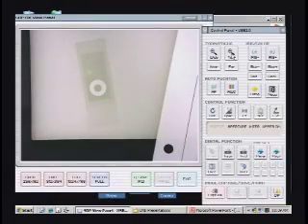My cell pellets are usually 100 microliters because I want it a little more dilute. Probably many of you are below 50, maybe 30, for your cell pellet. My recommendation is make it a little more dilute. Remember I told you, what if you have a high density of epithelial cells? You have 3 spots to work with too. And if you found that you didn't have enough there, you could make another slide. But so far, I haven't had to make a second slide.